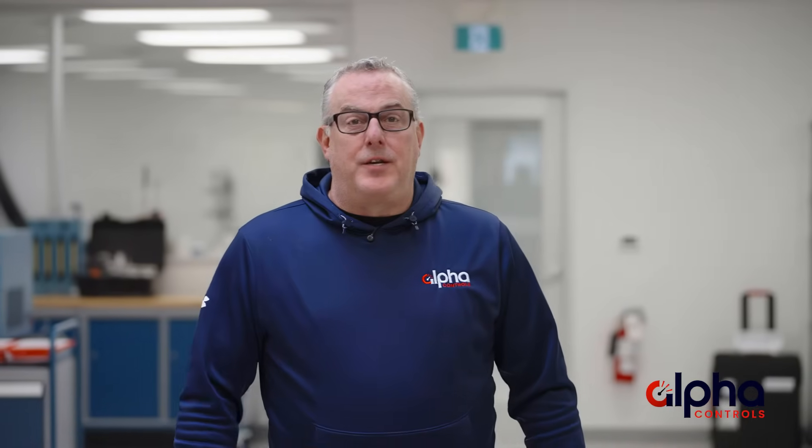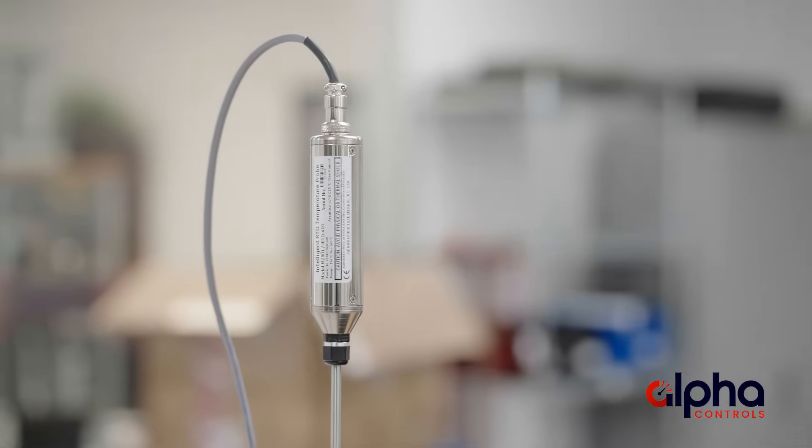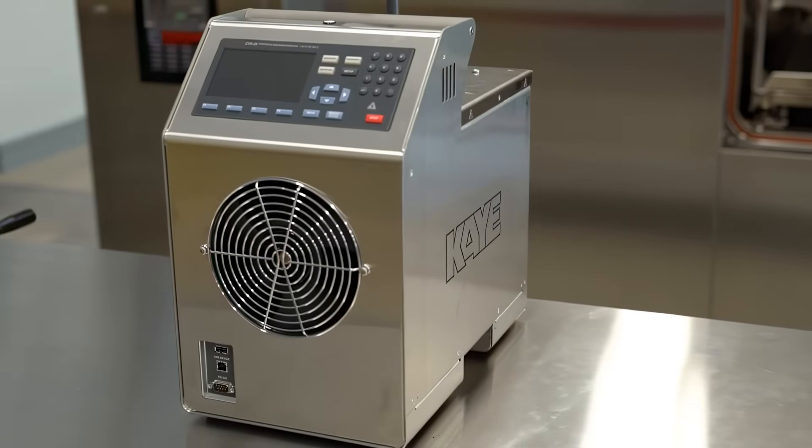When it comes to thermal validation, the Validator AVS is the cream of the crop. It offers a very versatile way to meet all your validation needs. Being such a critical piece of equipment, it also requires yearly maintenance and calibration — not only on the AVS itself, but also on the IRTDs and any temperature baths that you might be using.